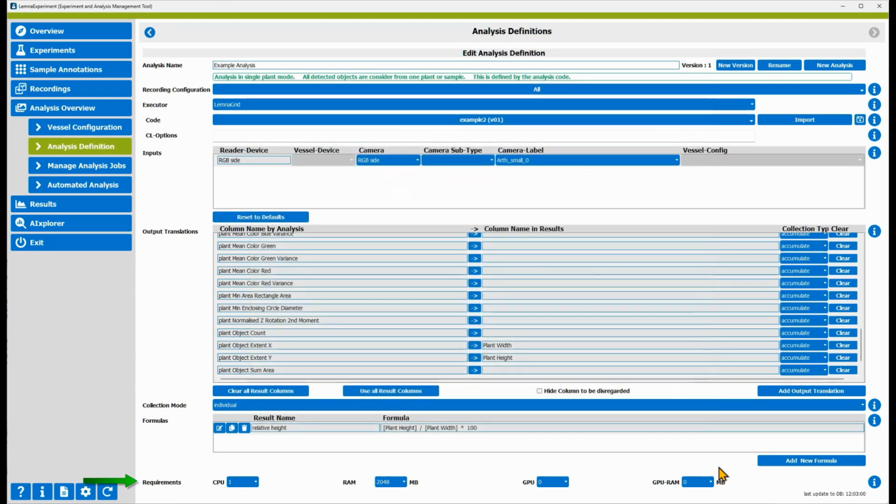If the GPU RAM is used almost completely, then set the number of required GPUs to 1. If the GPU RAM is used less than that, then take this value, round it up generously, and enter the required GPU RAM. In this case, 2 machine learning jobs may run in parallel on the same GPU, provided the sum of the required GPU RAM is less than the available GPU RAM. As with other dialogues, the values here are automatically saved, so you can just leave this page.